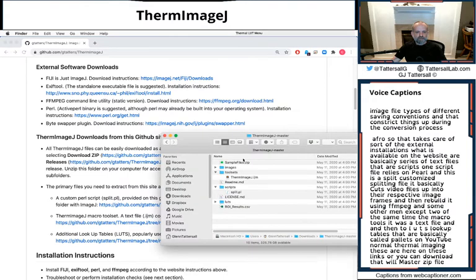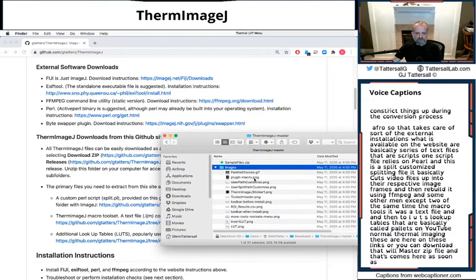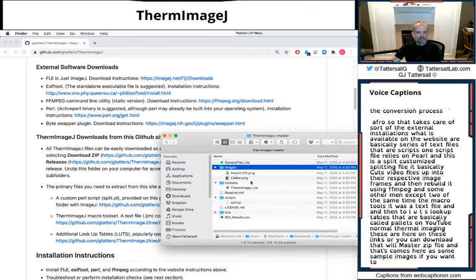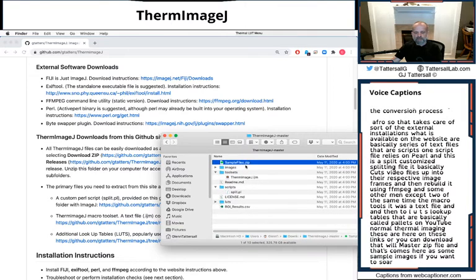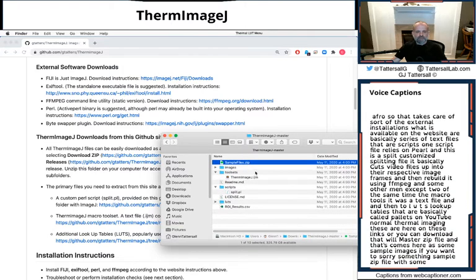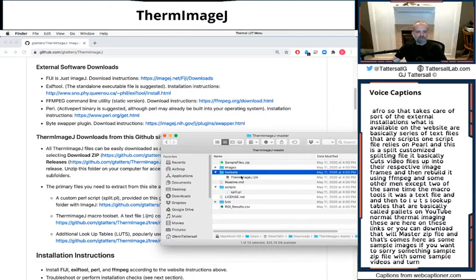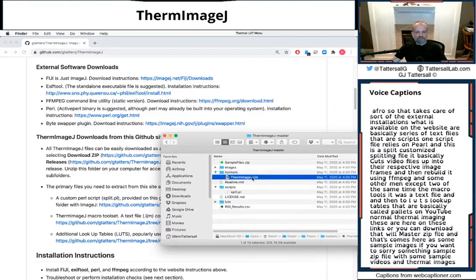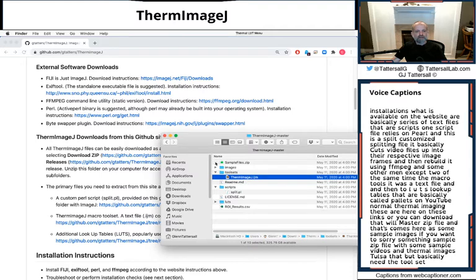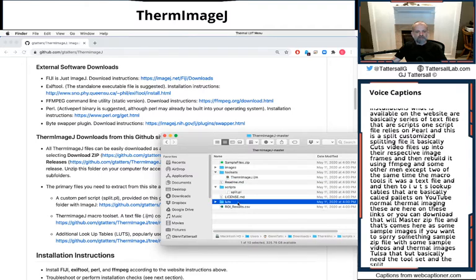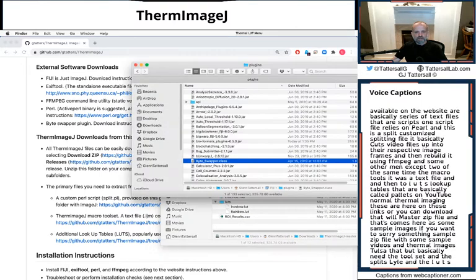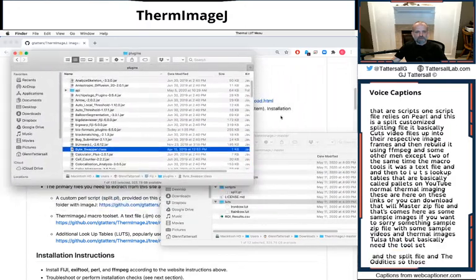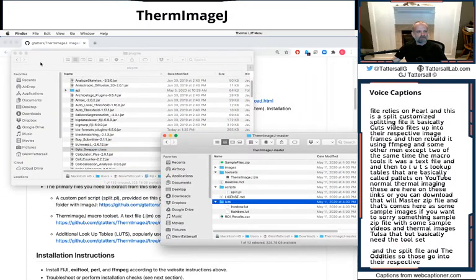And that comes here as some sample zip file with some sample videos and thermal images. The tool set - basically you need the tool set and the split file and the LUTs. And so those go into their respective folders.